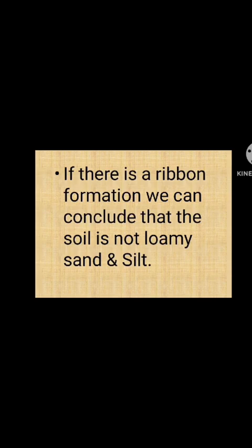If there is ribbon formation, we can conclude that the soil is not loamy sand or silt.